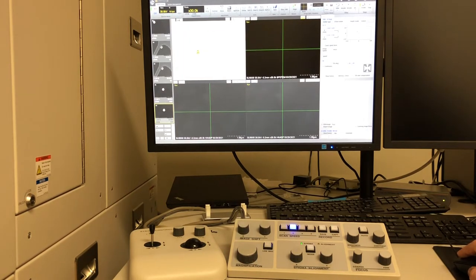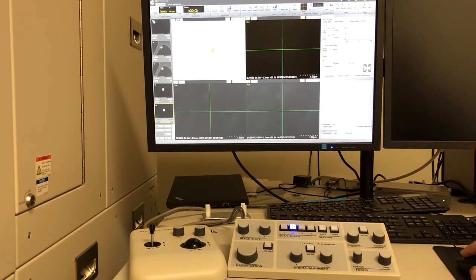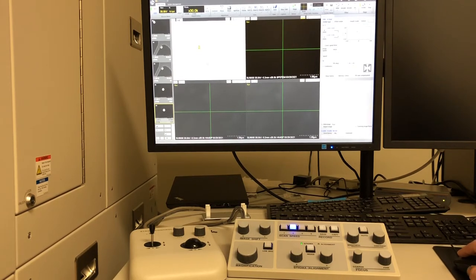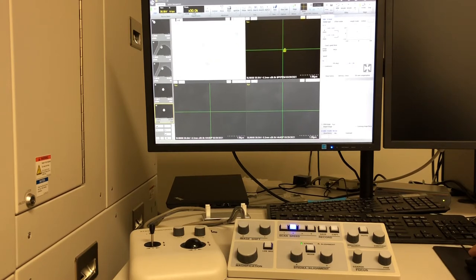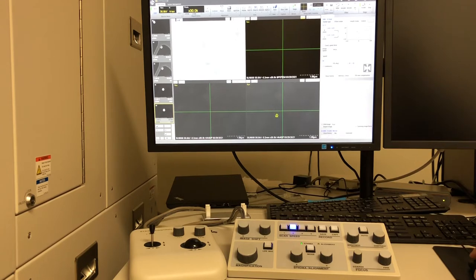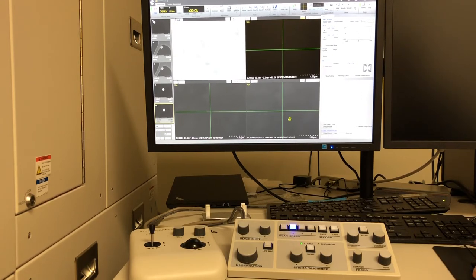In its current configuration, our screens are the secondary electron detector in the upper left, the bright field in the upper right, and HADF occupying both the bottom left and the bottom right.